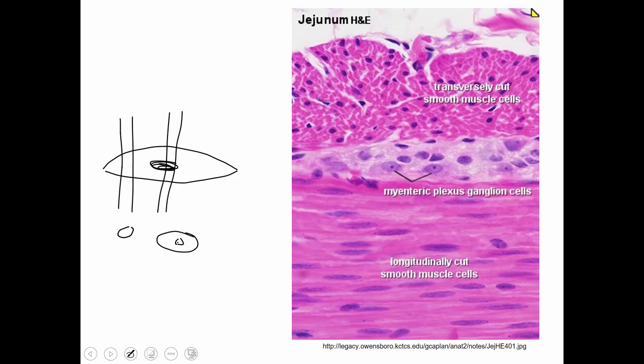And so when you look here, these are longitudinal profiles of smooth muscle. Here are the nuclei, and we'll talk about staining characteristics in a second. And then up here is transverse or same as cross sections of smooth muscle. And you'd appreciate this cross section has a nucleus present. But these profiles do not have nuclei present. You see that? So that kind of gives you a flavor of how that cell is shaped. So when you section it, what you expect to see. Okay? So if I did a section just like this, a cross section that's coming down like this, right? This one will have a nucleus present. Up here would not. Okay?